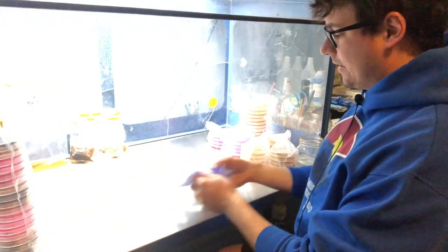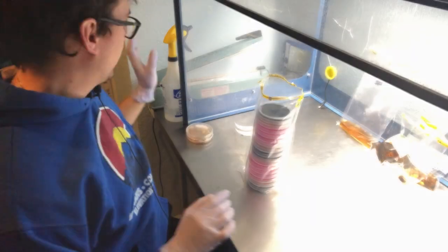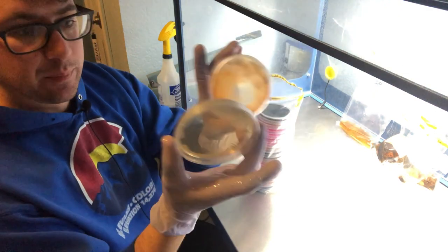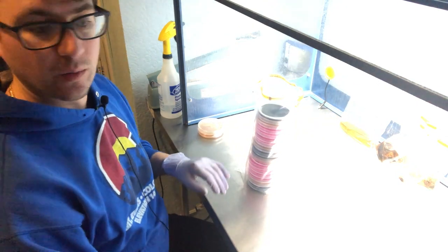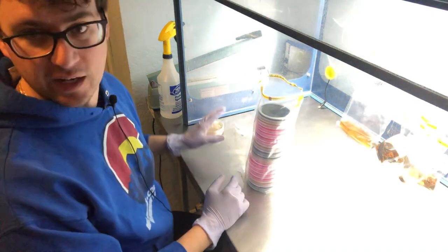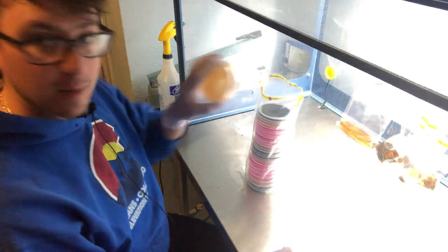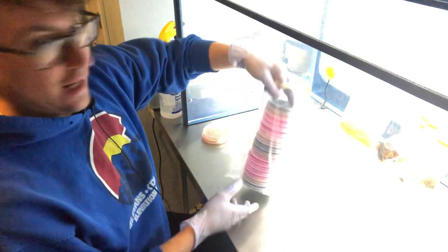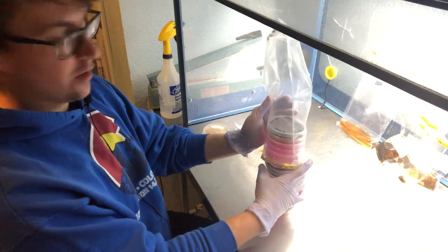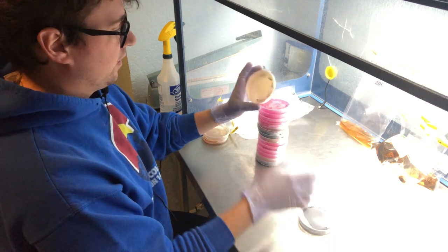I'll go ahead and get started by reviewing these petri dishes after 72 hours of growth. I'll go through these plate reads. I also have this Agrocyte parasitica and I'm going to be putting these isolated colonies on their own petri dish as well. The first isolate I got is already on a fruiting block, so I'll keep everyone posted once that goes into the fruiting room. This is the different Morchella species plated out onto various agar types - you can check out Fungi Friday number 14.